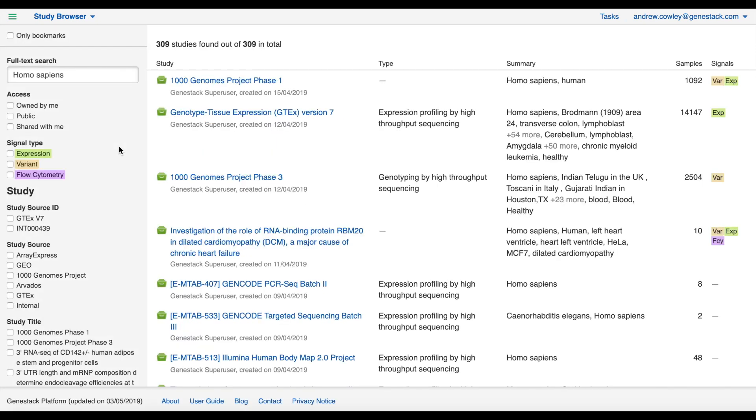Exactly which metadata fields are available as search facets is determined by something called templates, which is also how we specify which metadata we expect to see for a given type of omics data and which controlled vocabularies or ontology should apply to that field. But more about that in another tutorial.